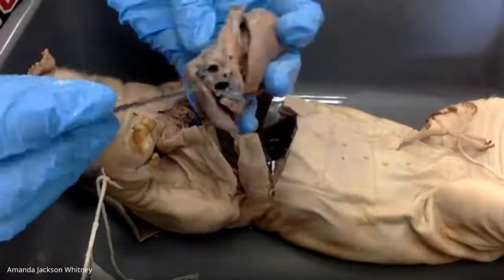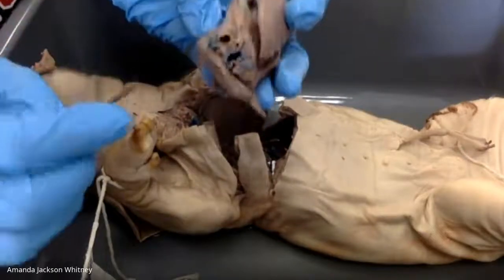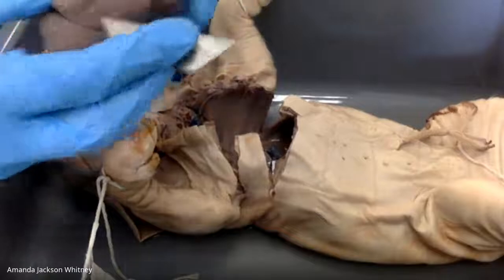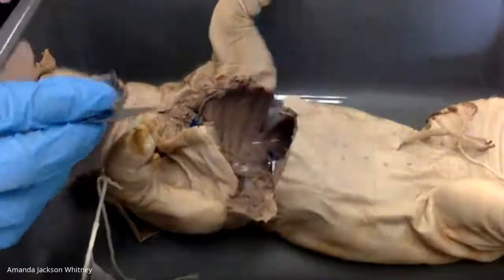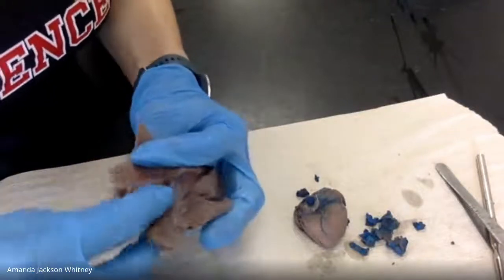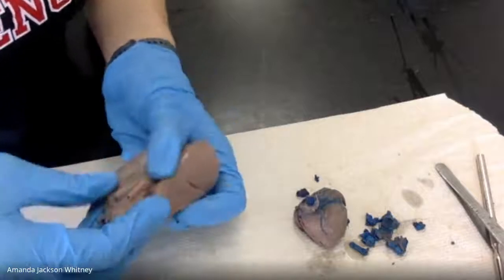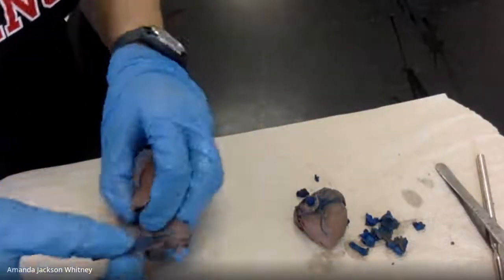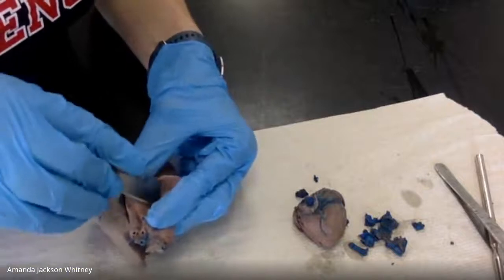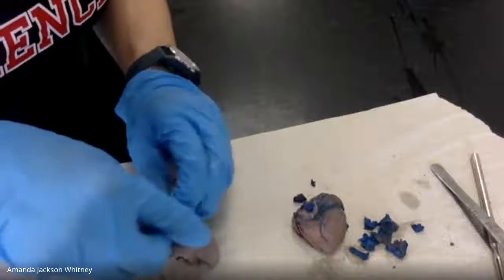So now we get a good shot of aorta and vena cava, and you can see the difference in size between those. All right, here's our lungs. I'm going to scoot Louie over. We'll take a look at those. Okay. There's some glands on here that we didn't talk about, so I'm not going to focus on those. Some other connective tissues. I'm just going to cut those off so we're not confused on those things. Don't worry about all that.